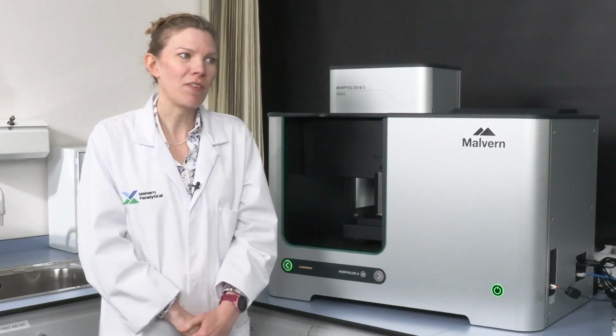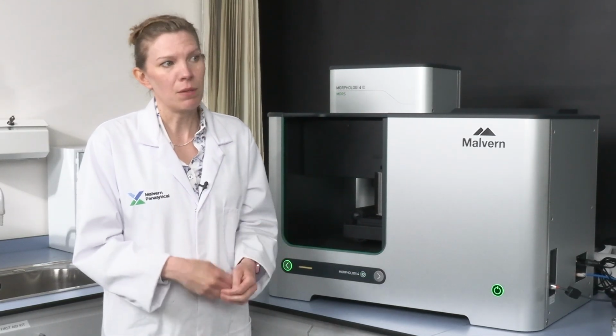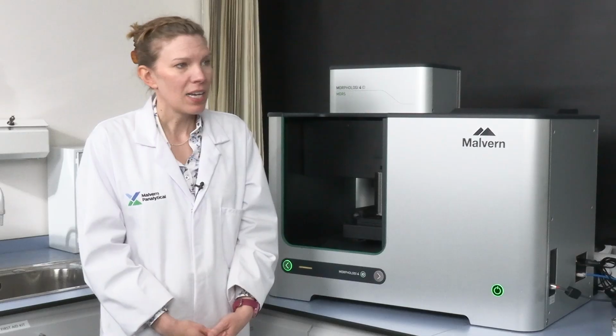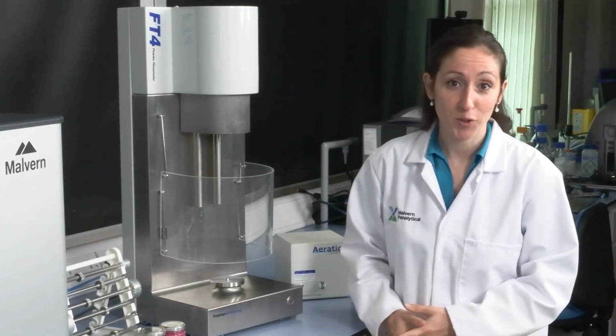That's really interesting because then the size and shape analysis that the Morphologi can do can inform the results of the FT4. Absolutely. So you might have a powder with similar size distribution, but process completely different. One might block your die, one might flow fine. And that could be down to the shape of the materials. If you have irregular shaped particles, this can tend to restrict the flow. So that's where the FT4 comes in.